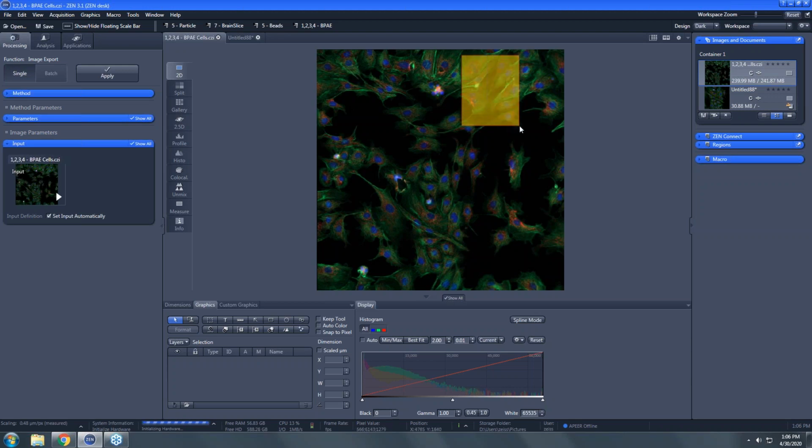So the ROI tool, oh, you got to select the ROI tool again. Oh, right, my mistake. There you go. You can, if you want to, set it and then copy and then paste it after you've set it. So if you do your 2200 and your 2000 again, instead of drawing it every time, you can now Control C and Control V, or right click on it, I think, and copy paste. I'm not sure about that. I always use Control C, Control V. There you go. And that gives you another ROI, and you can just drag that to another region of the image if you'd like.